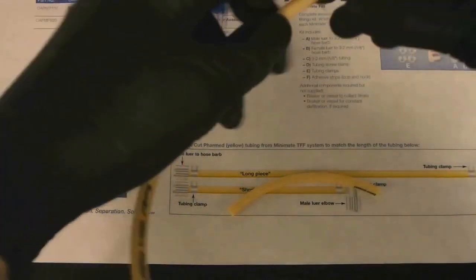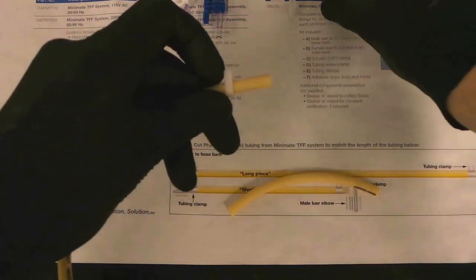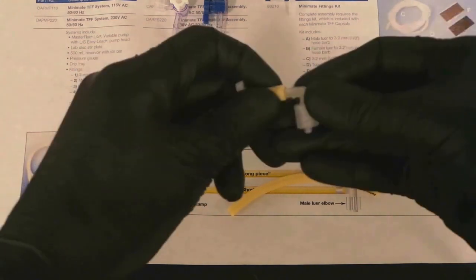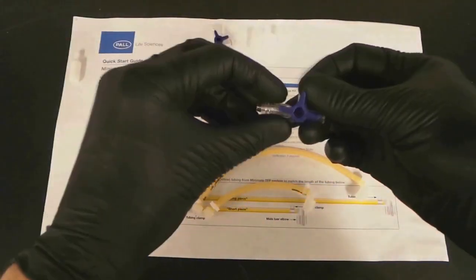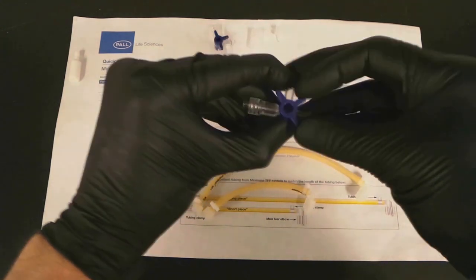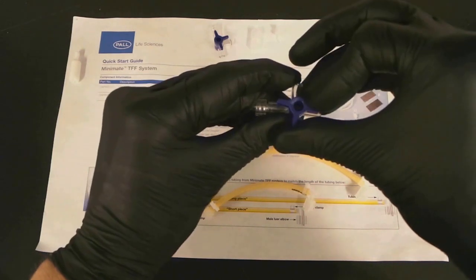Secure the lure connectors with the tubing clamp. Three-way adapter valves will be used initially on the reservoir and then with the LV CentralMate holder, so get used to how the valve on top works to direct the flow properly.